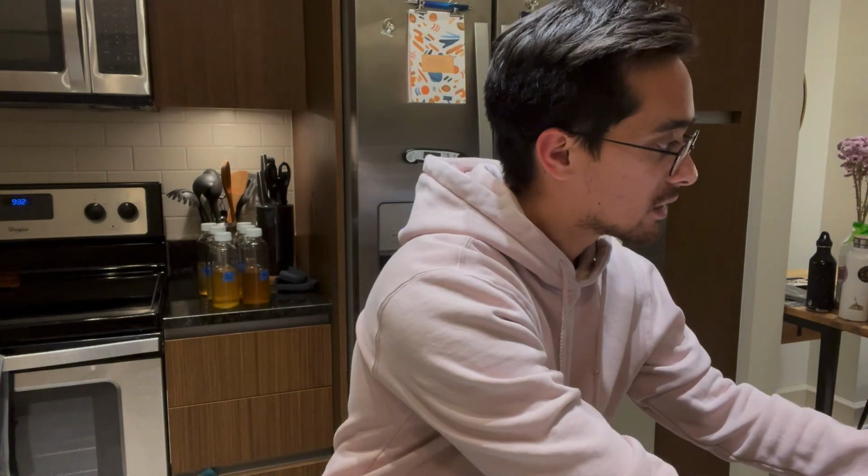And that last one is definitely the lowest measurement that we've gotten so far. So 2.2 translates to right around 10-ish, 11 grams of sugar. The bottle here says 6, well that's actually 10 or 11 grams per half of a liter. This is a 12-ounce bottle, so if I do my math, that's going to be, I'm not going to be able to do my math.